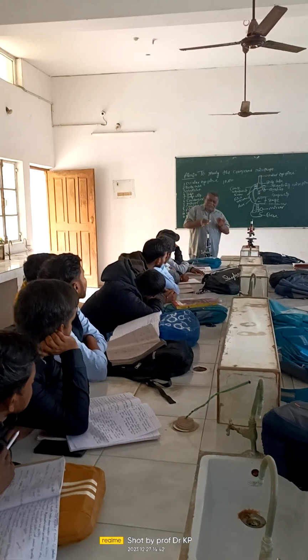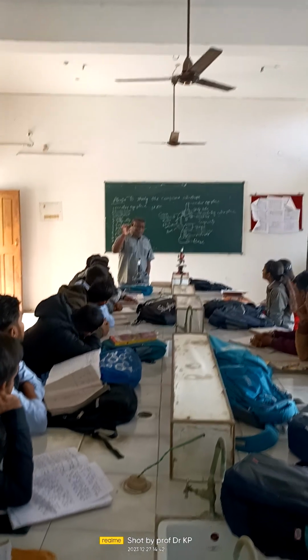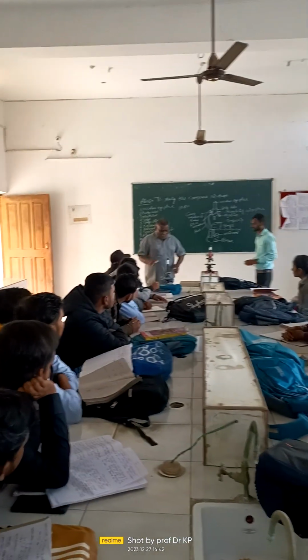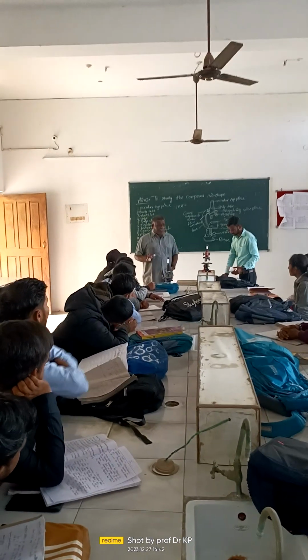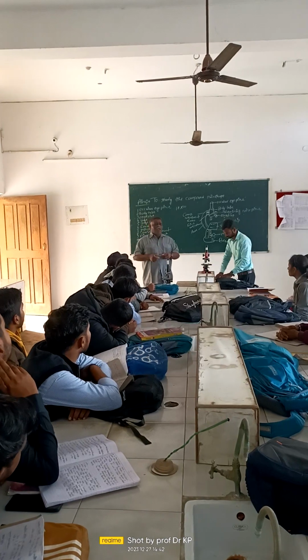You will focus and you will see, then you will dismantle and go away. You understand? It's a permanent slide, right? Very well preserved, it will last for a very long time. Clear? Yeah. So years and years you can preserve it. You give me an ordinary slide. So this is the slide on which you have to keep the material.